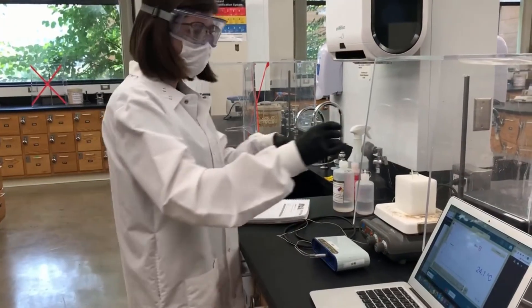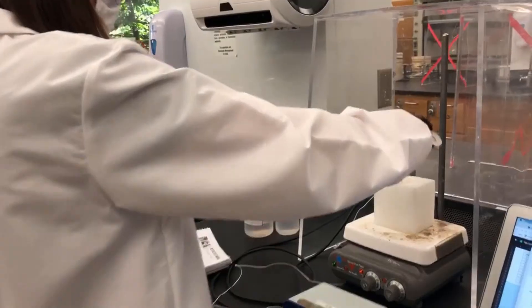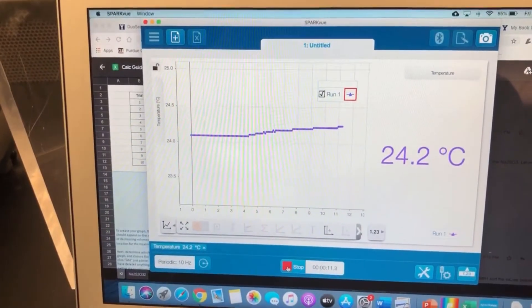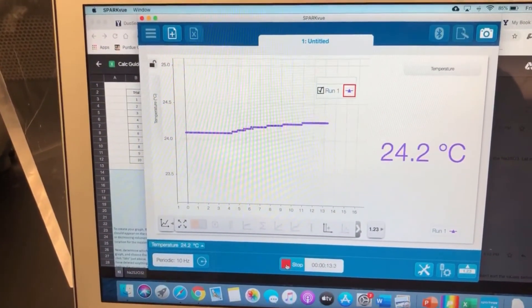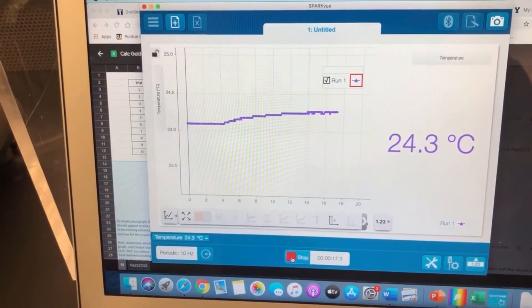I already have the bleach in here and I'm just going to add in my unknown so you can see the temperature is starting to rise. And then we'll just keep track of what the highest temperature it gets to is so that we can subtract it from the initial temperature.